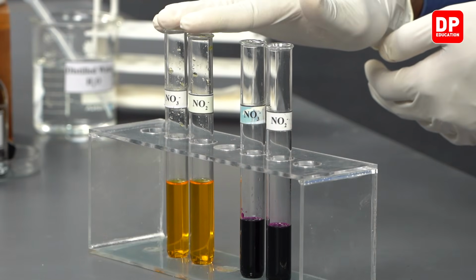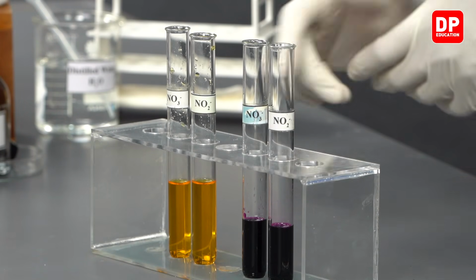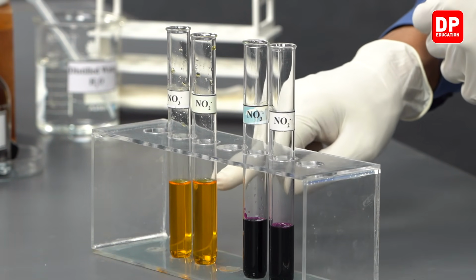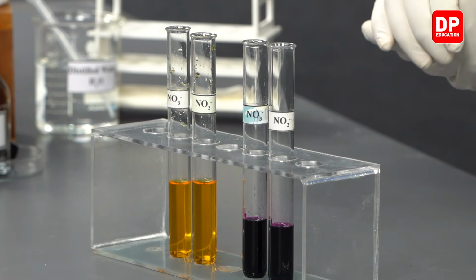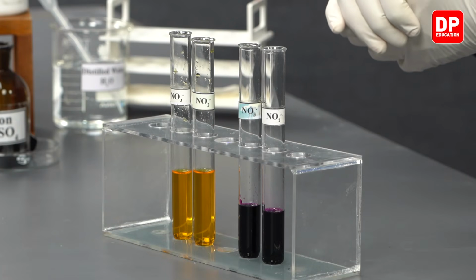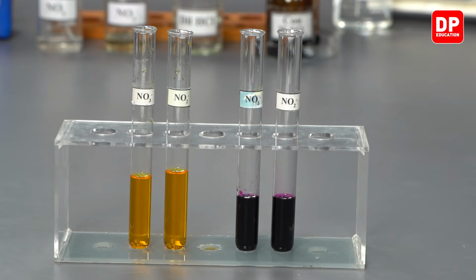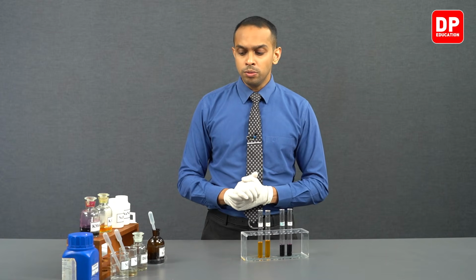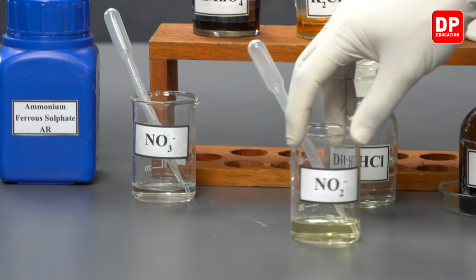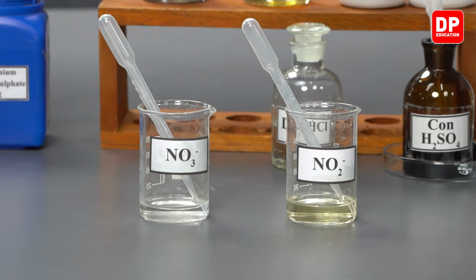Now, to 2 of these test tubes, we have taken acidified potassium dichromate, which are yellow color solutions, as you can see here. And to the remainder of the 2 test tubes, we have taken acidified potassium permanganate, which are purple in color. And to each of these test tubes, we will be adding a nitrate ion solution and a nitrite ion solution. Now, we have our nitrite ion solution here and the nitrate ion solution.